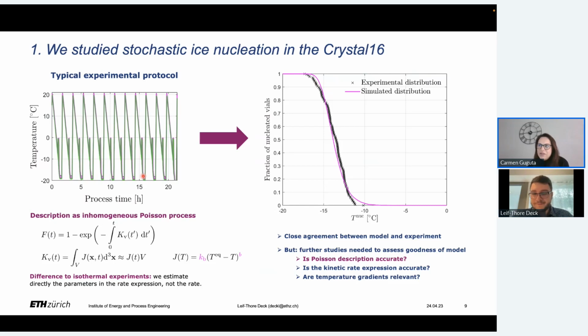Yeah. And I think this is also true not only for this specific case study, but also for crystallization. What I do recall is that indeed the temperature control in the Crystal16 version 2, or let's put it differently, in the latest generation that we have now, is improved.